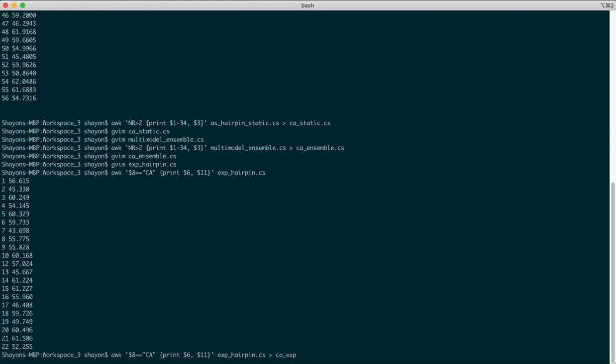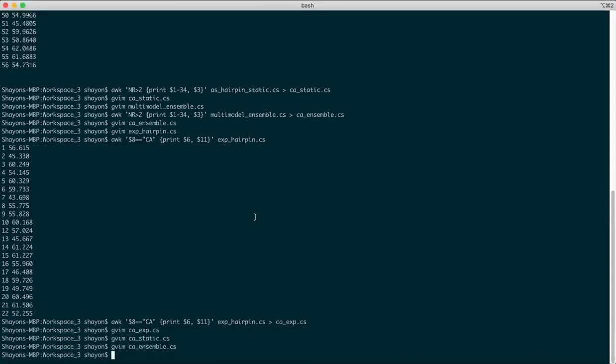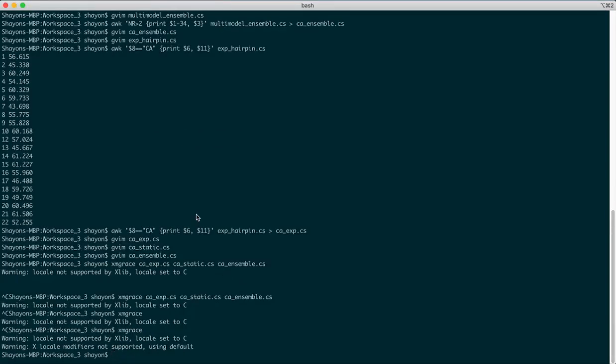So the C alpha chemical shift predictions for the experimental values .cs. Okay, we'll use a program called XMGrace. So XMGrace is a 2D plotting tool that allows you to interactively modify plots and save figures in the format of your choice. So it's a very efficient plotting program. But you don't need to use this strictly. So you can also use Excel if you want to make your plots.